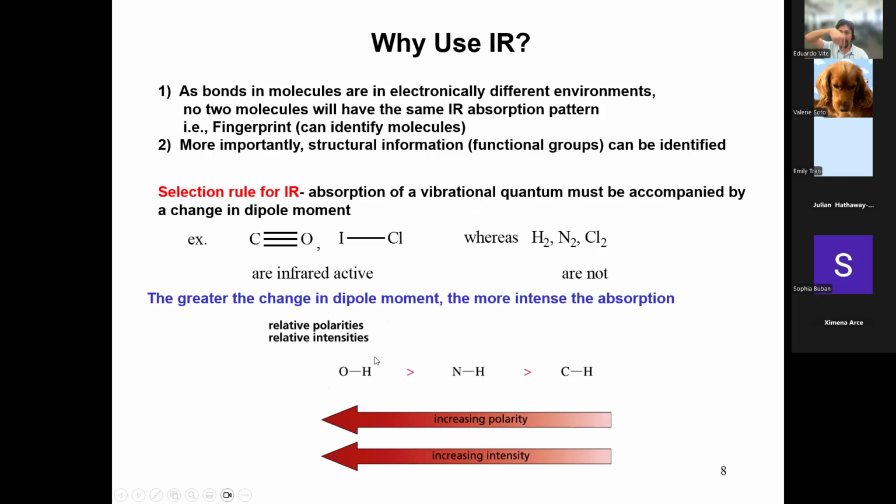And also, when you see it on the y-axis, the peak is going to be closer to the bottom because it's going to be very intense. That is the word that we use, intensity. So your y-axis is your bond dipole change intensity. X-axis is the bond strength. Y-axis is dipole change intensity. Okay, they are not exactly the same thing.